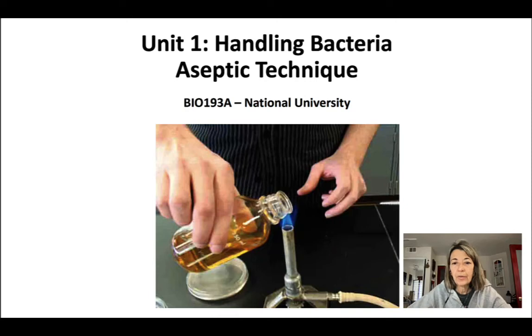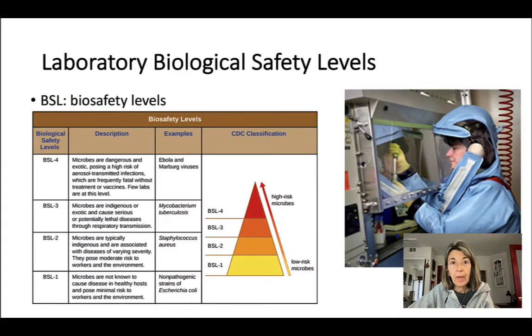Hi class, this is a quick recording regarding the material in Unit 1. Unit 1 is related to biosafety and aseptic technique, and you are supposed to complete 2 labs or simulations related to this. So let me get started with biological safety levels, or BSL.